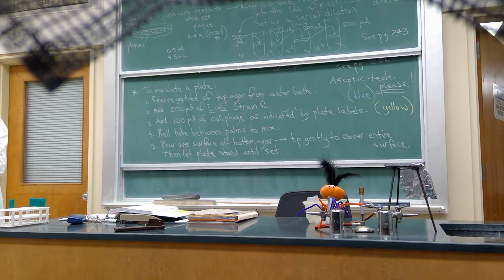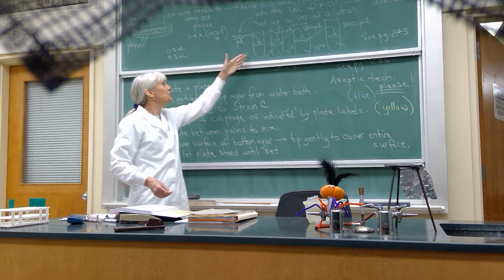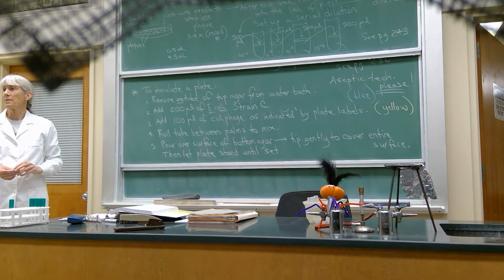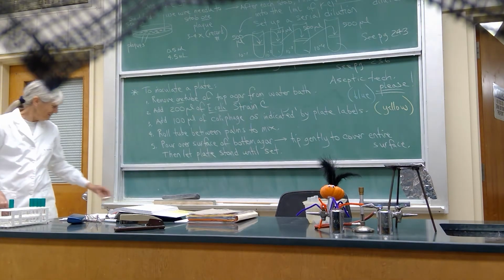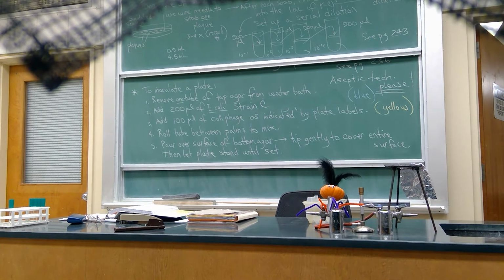So we're transferring between the two, we use the blue pipette and 500 microliters. Yes, so you're going to use the blue pipette for these 500 microliter transfers. Make sure you change the tip after each step. And then the 1 milliliter of the original, do we take 500 microliters for this as well? Yeah, that should be 1 mil in there. I hope it is. That's what it says it is. It looks kind of scrawny to me, but they should be 1.